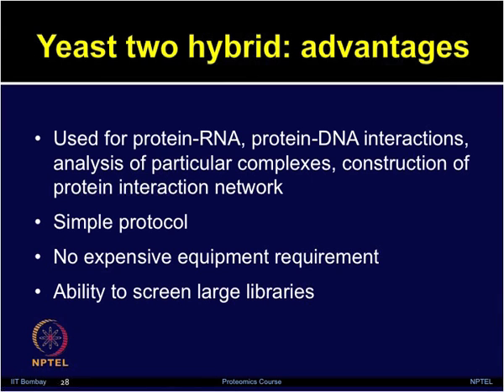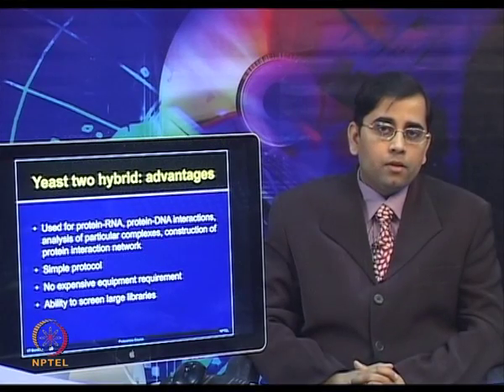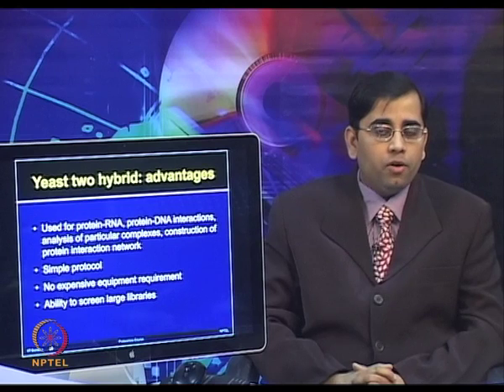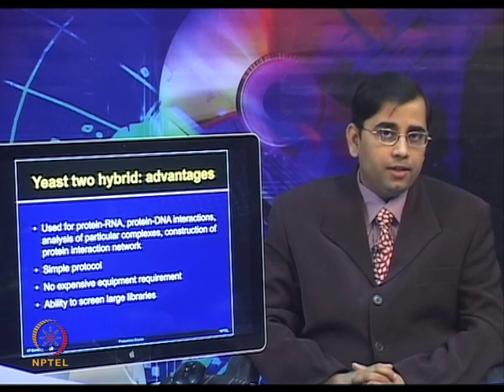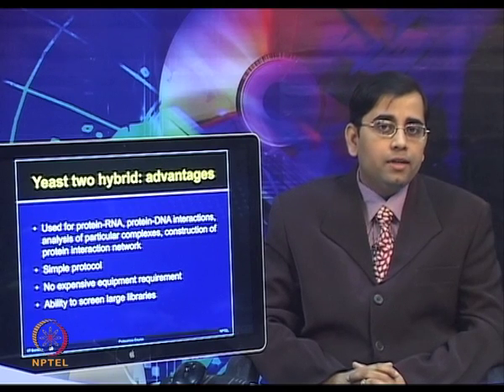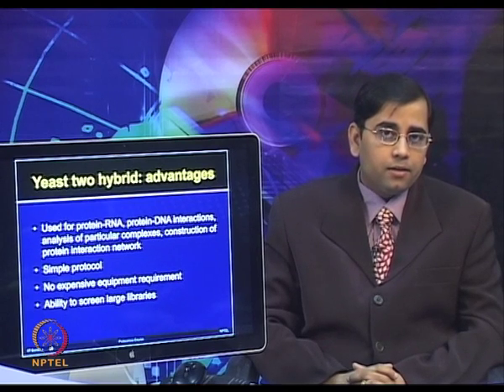The protocol for yeast two-hybrid is quite simple. Unlike the other approaches, there is no requirement for heavy instrumentation here. This method also allows screening of large libraries.